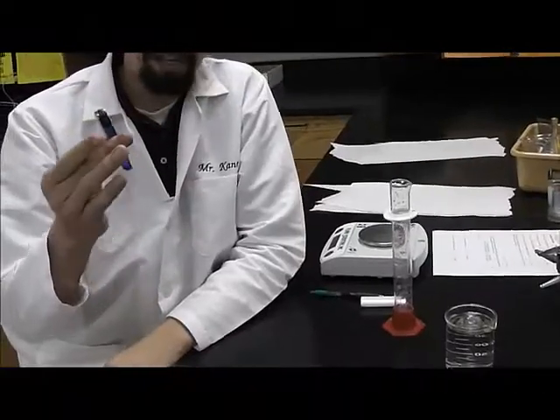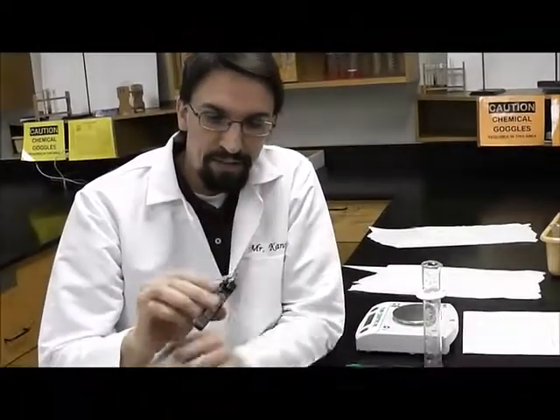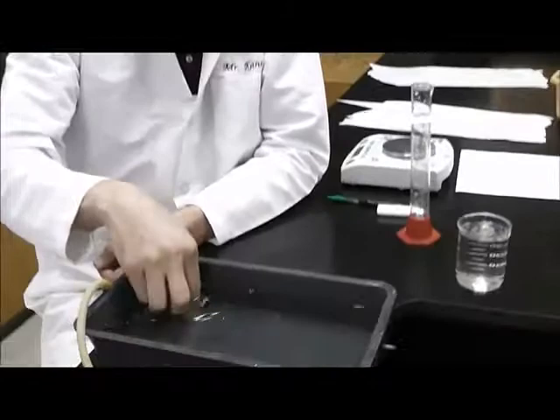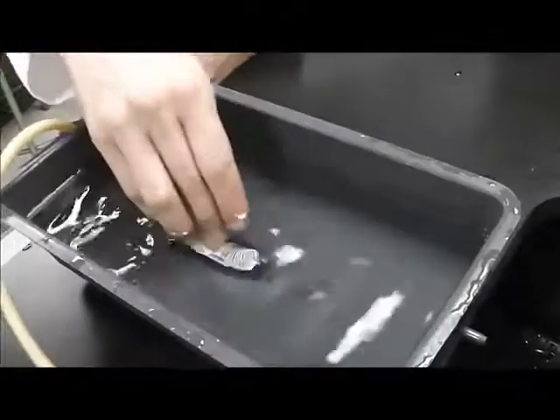So you're going to have to get the lighter wet. There are little crevices where the water can get into the lighter, so we want to keep that as constant as possible. The first thing we're going to do is stick the lighter in water for a little while. Sometimes you have to hold it down to get it nice and wet.